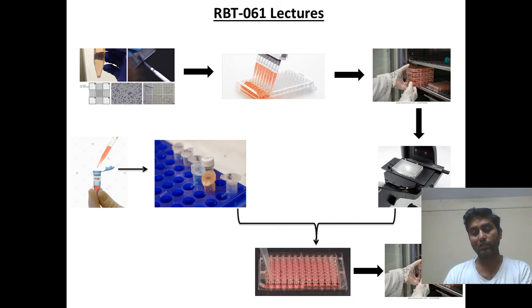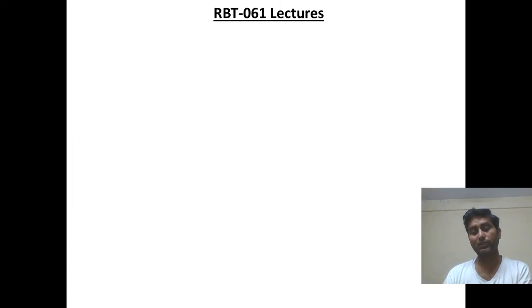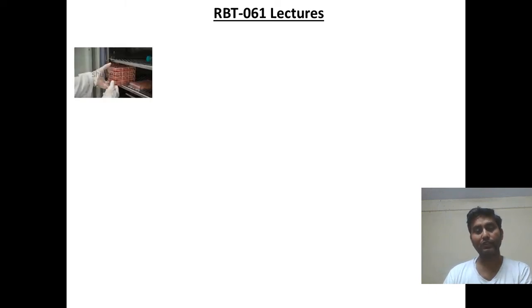Then we'll incubate it again for the hours we want to test, whether it is 24 hours, 48 hours or 72 hours. After the incubation time is over, we'll take out the plates and go for adding MTT.